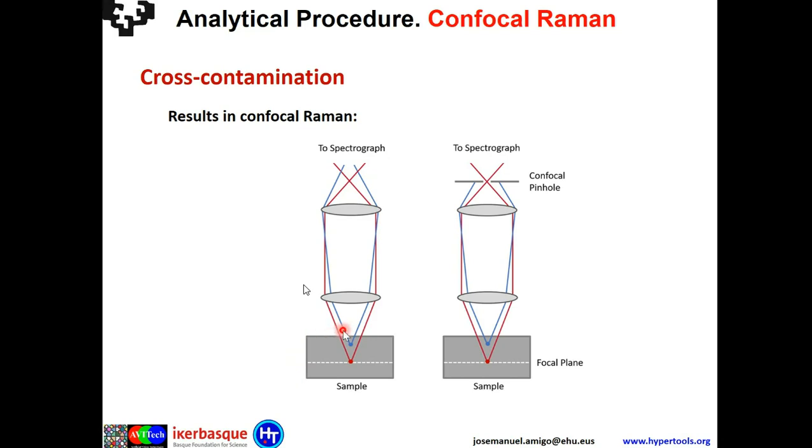We were able to measure what is inside this volume without touching it. And this is fantastic. First of all, because we will measure this volume and we will know exactly where the microplastic is. And second of all, we know that if we find a microplastic that is inside this volume, it's a microplastic that actually arrived there because the muscle ate it and not because it was a cross contamination induced by us in the lab.